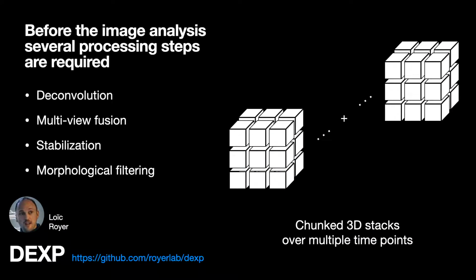Before proceeding with the image analysis, when the data is acquired from our microscopes, it requires a lot of preprocessing, and for that we implemented our own library, which uses Zarr, CuPy, and Dask to process our data in the GPU even when we need some neighborhood across different chunks of data in the spatial or time domain.